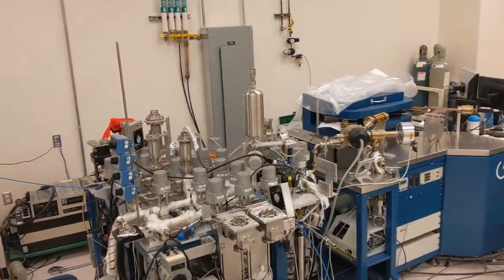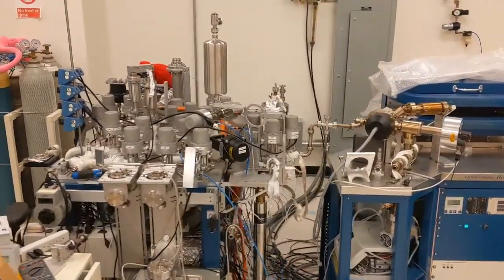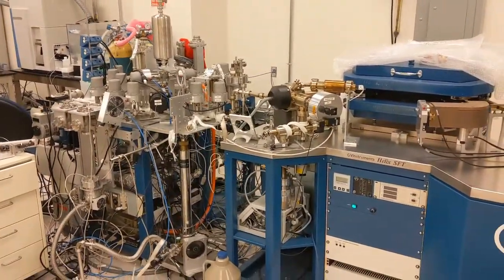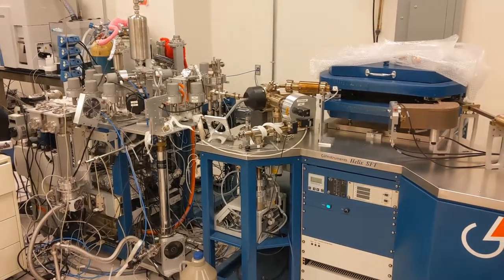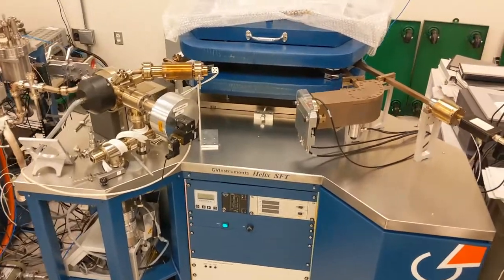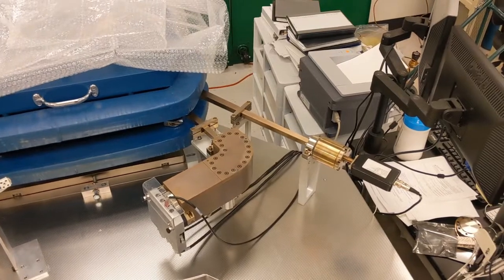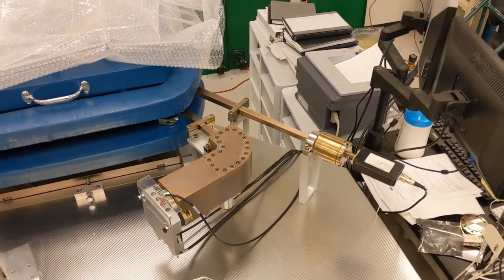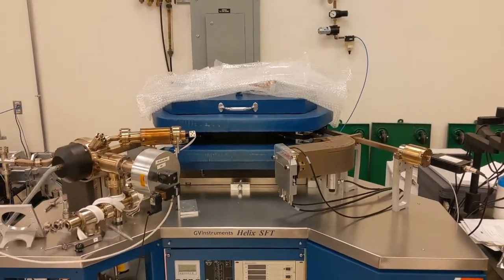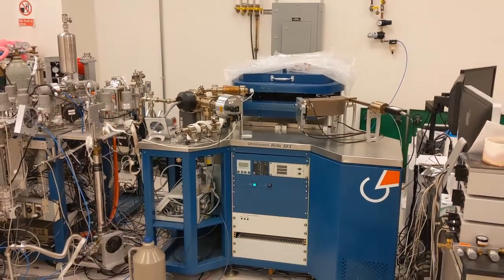On the left is an ultra-high vacuum extraction line where we can purify and concentrate noble gases extracted from a mineral sample. These gases are ionized on a hot filament and accelerated through a magnetic field created here by the large blue magnet enveloping the flight tube. Ions of greater mass have their trajectory bent less sharply by the magnetic field than lighter mass ions, allowing for the physical separation of isotopes of interest. This instrument has a split flight tube design which permits the simultaneous detection of helium-4 ion beam on the far arm and a helium-3 ion beam on the arm closer to us.